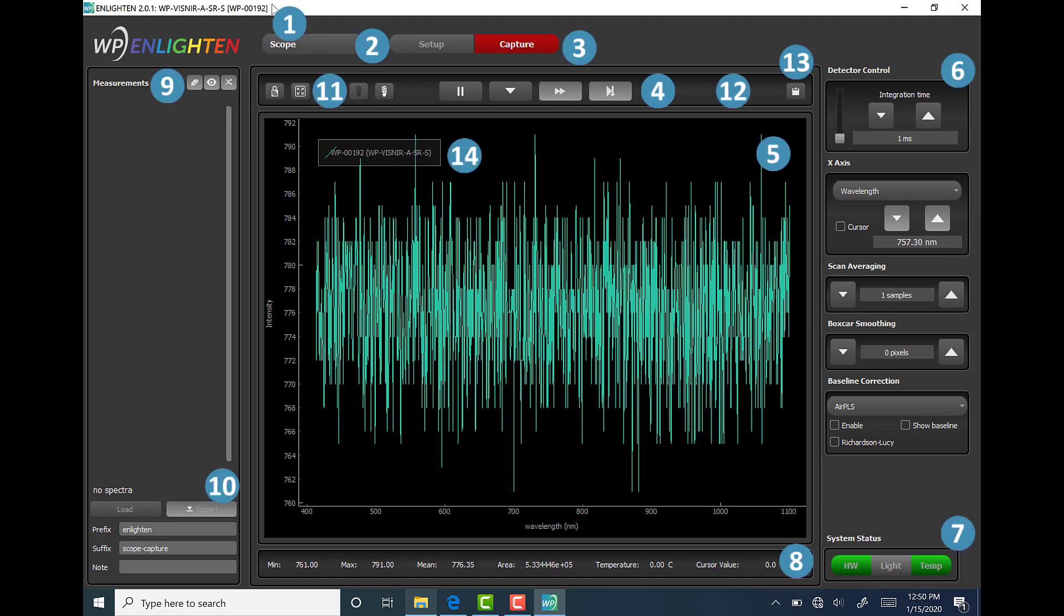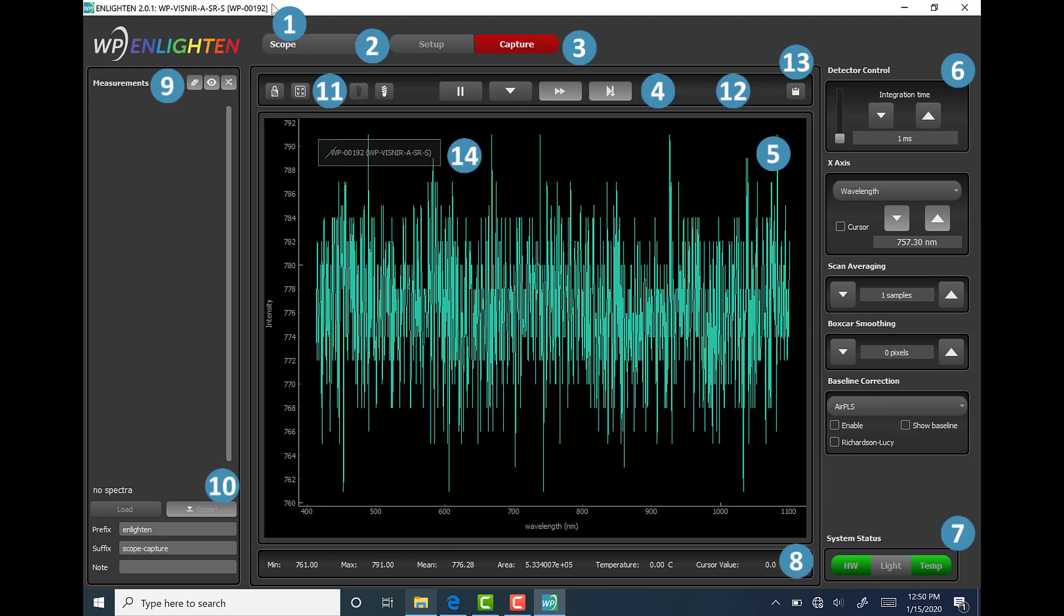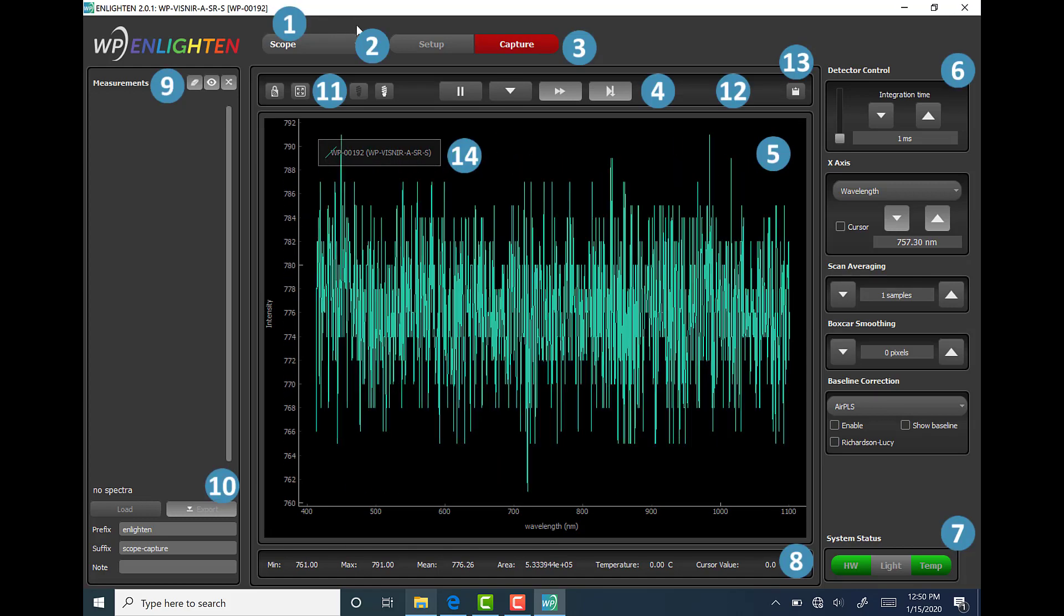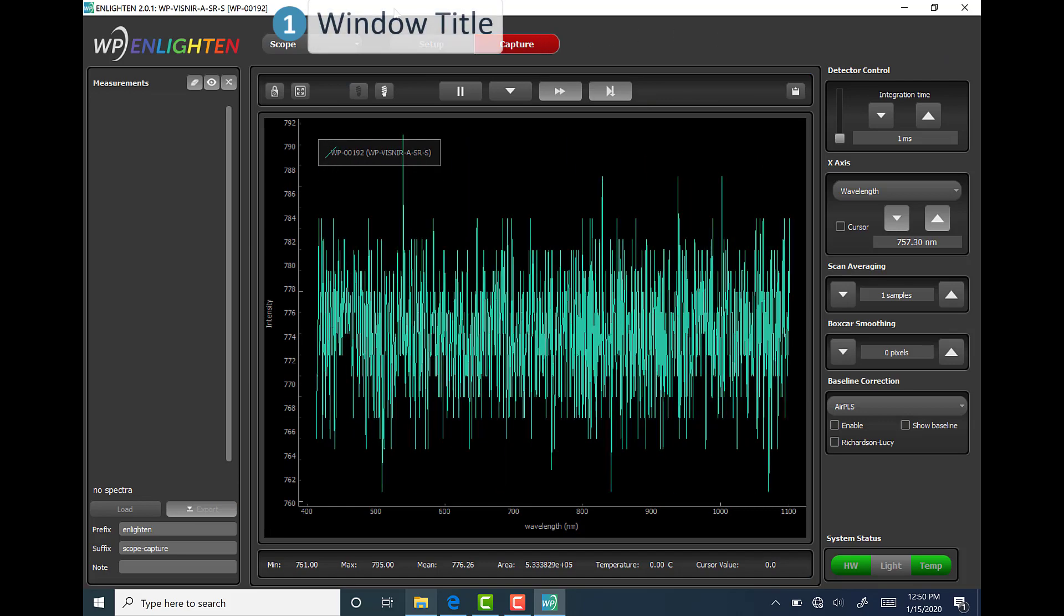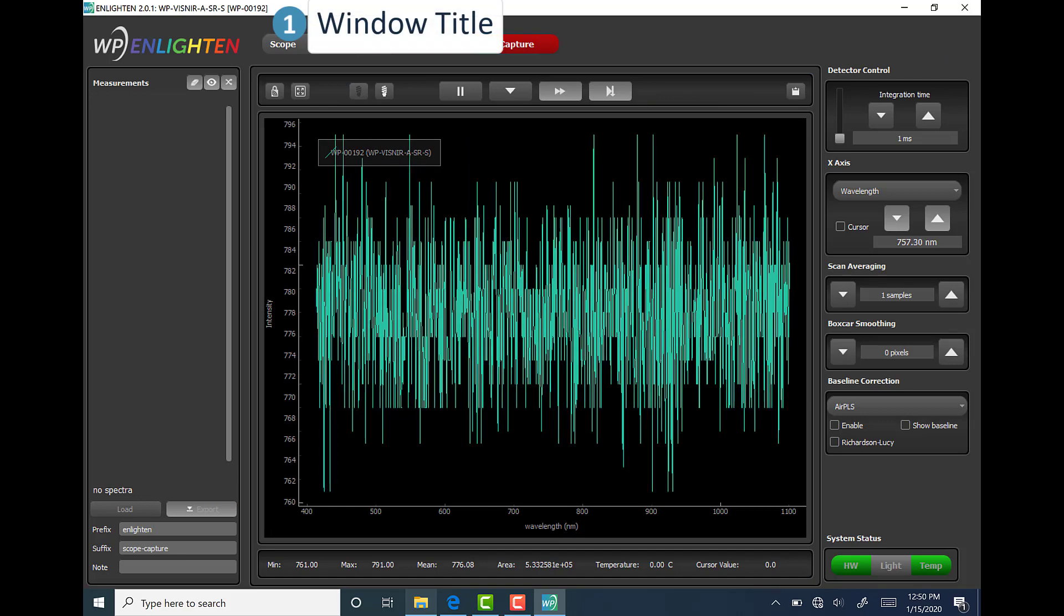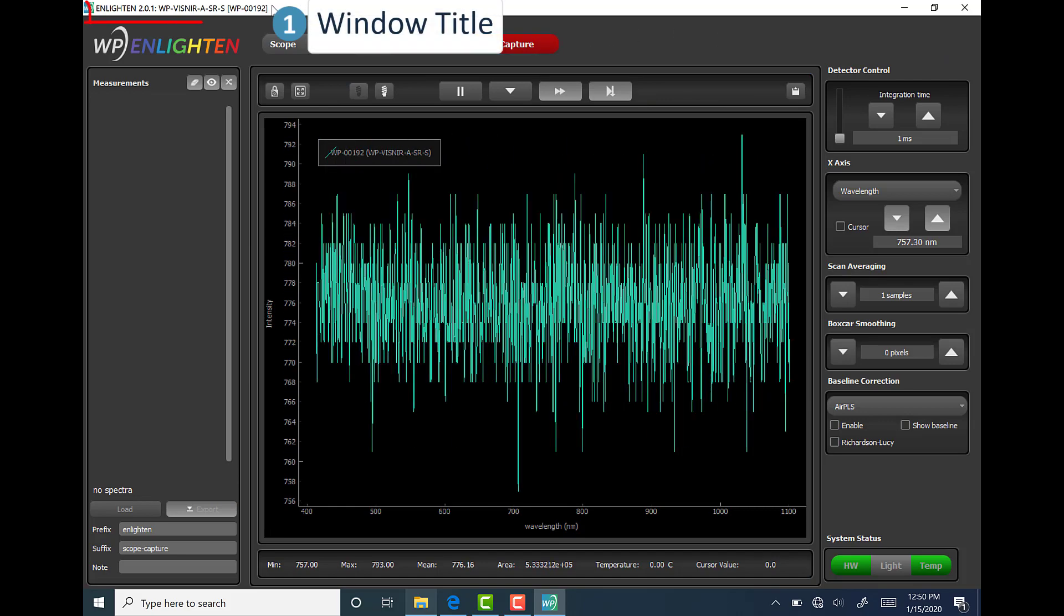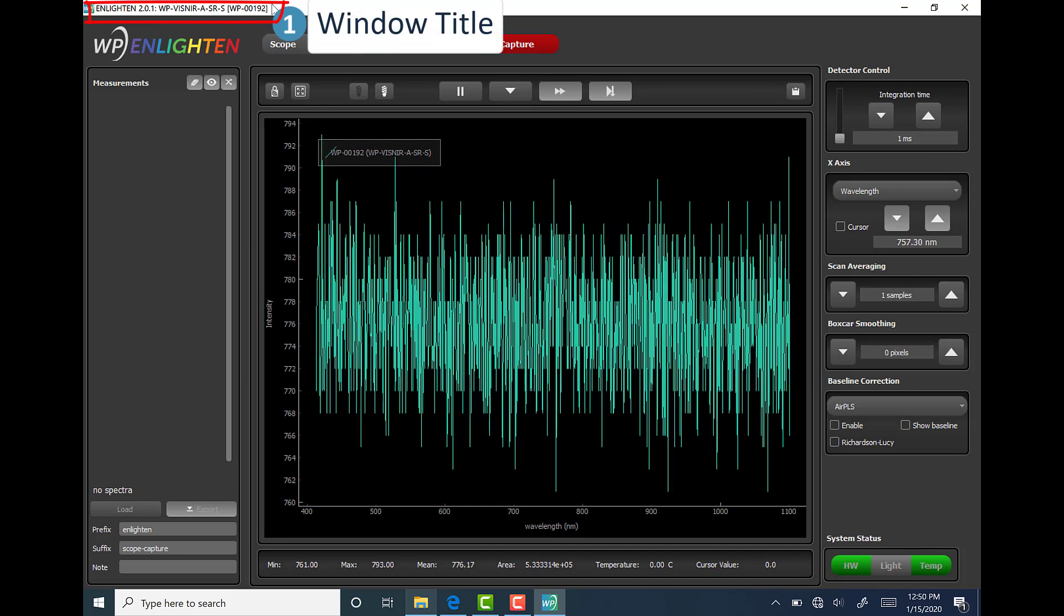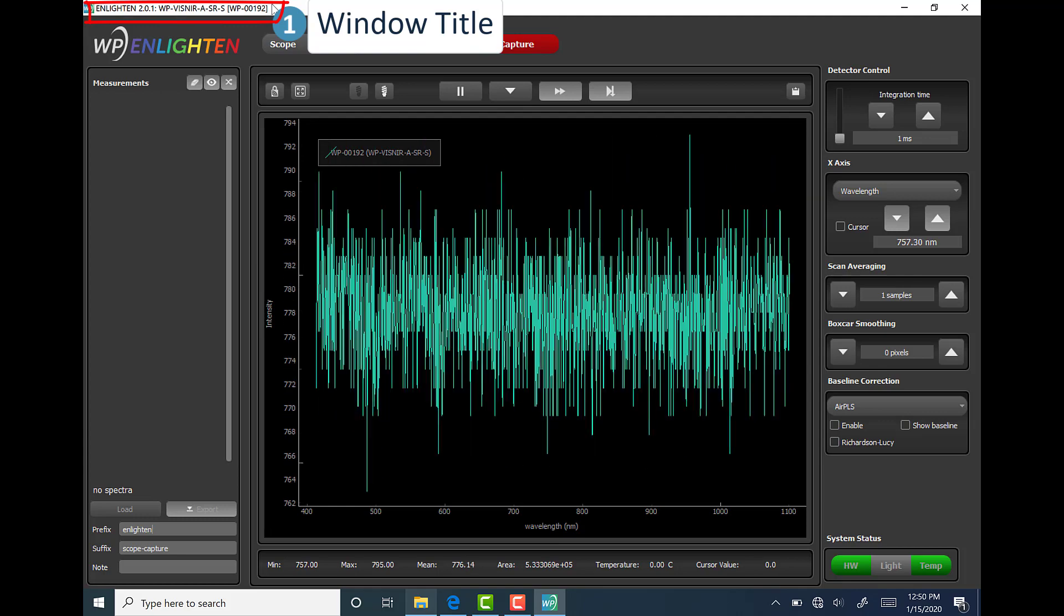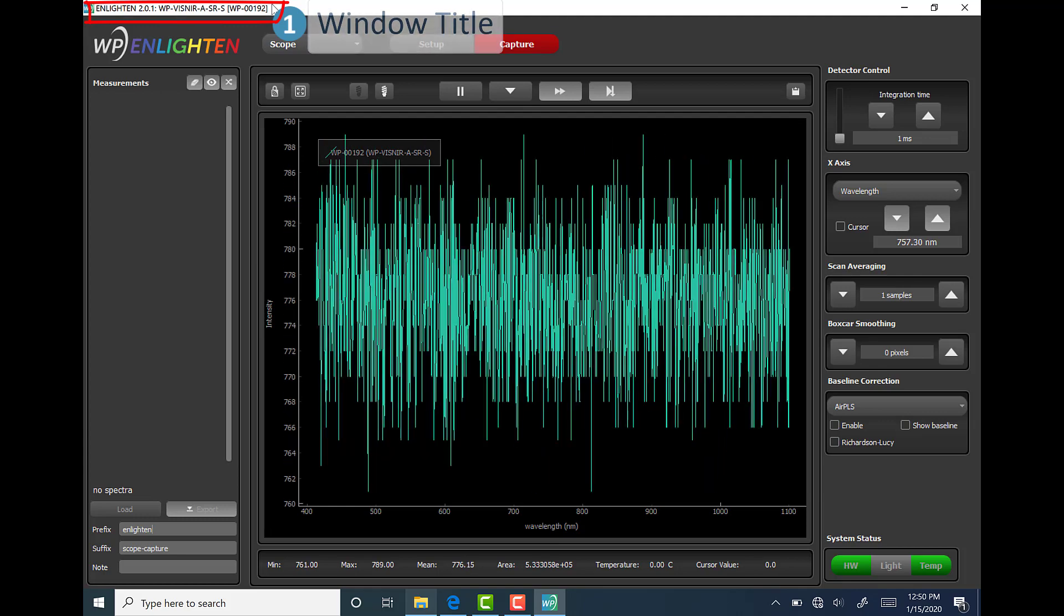There are 14 main areas in this window that all users need to be aware of. The first is called Window Title, and this is where the software version and model and serial number of the spectrometer can be found.